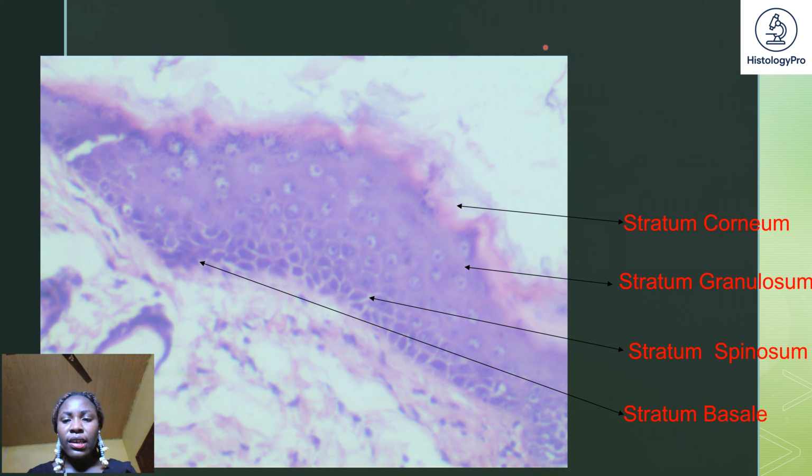You can see a slightly darker purple fine band around the top of the cellular portion in this image. Before I go to the next layer, the function of stratum granulosum: its granules help bind keratin filaments together and contribute to the water resistance barrier.